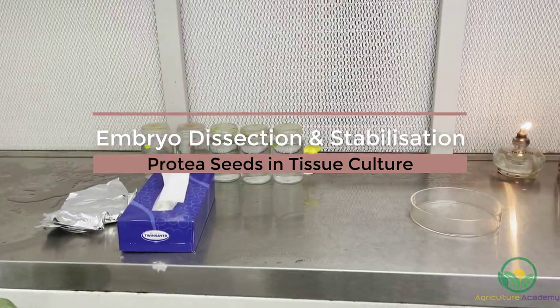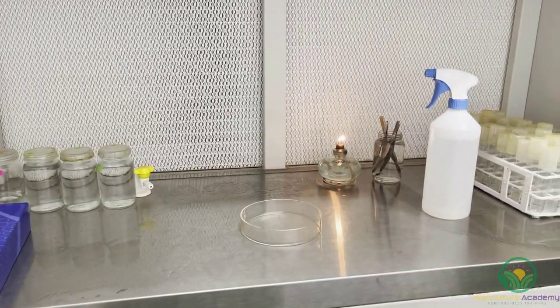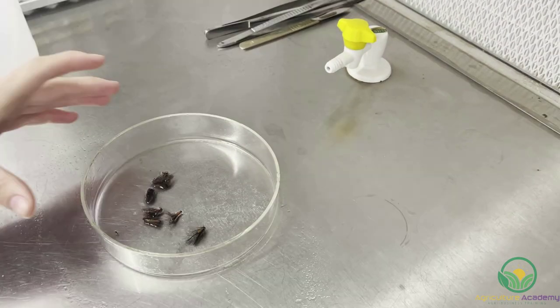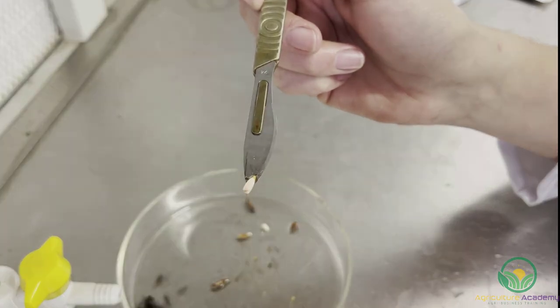After the test tubes and other tools had been sterilized, the equipment was placed in the laminar flow cabinet. This cabinet must be turned on at least 24 hours before work begins under the hood. These cabinets blow sterile air across the work surface and therefore limit contamination. In the case of protea seeds, the seed coats are often hard and contain compounds that inhibit germination. Therefore, tissue culture can be used to improve germination by dissecting the embryos from the seed.